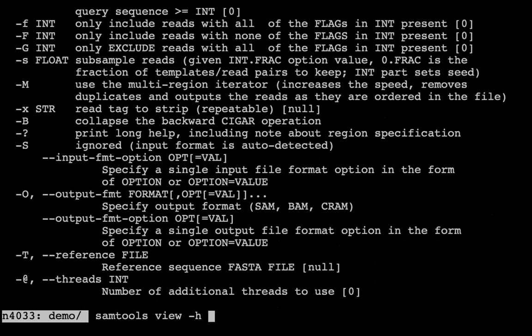The H option converts it to a full SAM format, so it's a SAM format with the header. The default is to just behead the SAM and remove the header, showing the records directly. And the sample was P10, I think, like this.